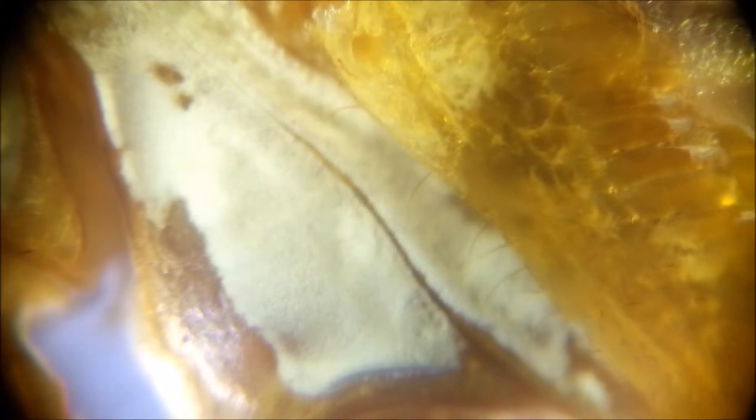Let's see if we can get to the back. So there's a lot of air in the little hairs that are on a scorpion, trapped along the body. You can see those air pockets underneath. And there's more of that air trapped in with the scorpion. You can kind of see it. And back to the tail.